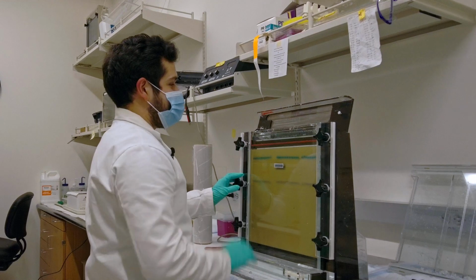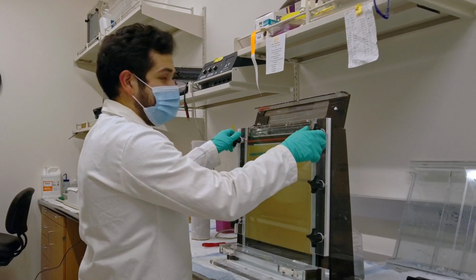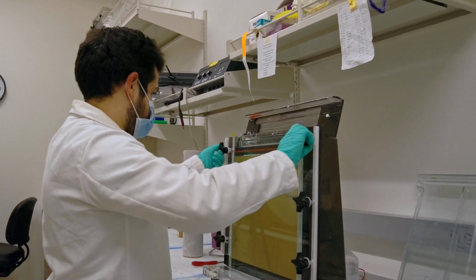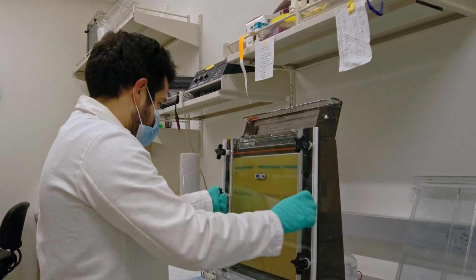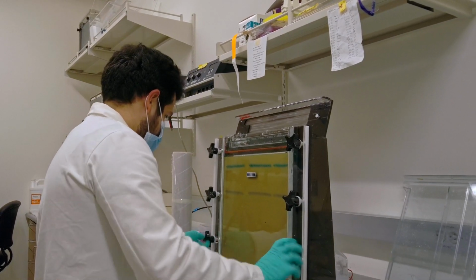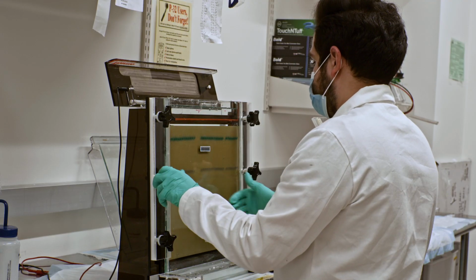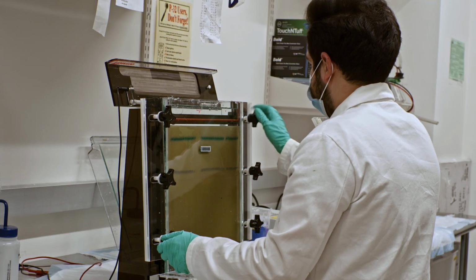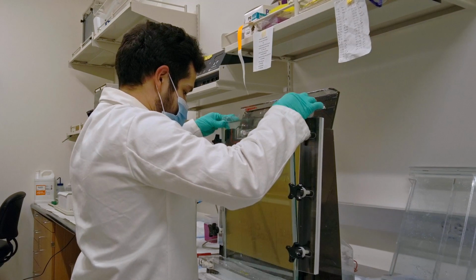So now that the top compartment has been completely drained of the running buffer, we'll now have to get the gel out. I do this by slowly releasing the gel from the knobs. If you see any of the running buffer come through, that's completely fine, because now that your run is done, it's not as critical to not have any of this buffer on the back. You can just clean it off later by using water. Now we're going to take the gel, lift it out, and move on over.